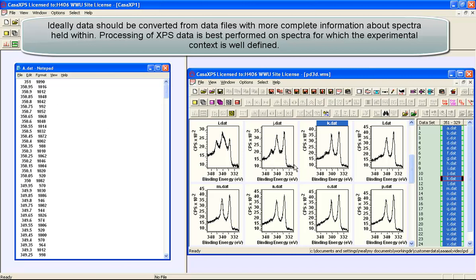Each file within that directory is entered into a new VAMAS file resulting in a set of data that can be processed as a unit within CASA XPS.